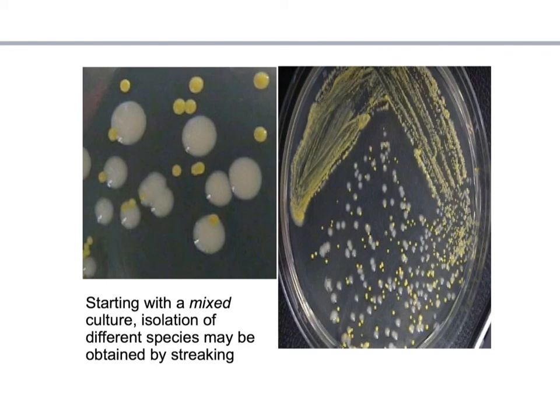The purpose of streaking a plate would be to take one of these bacteria that we're wanting to work with and transfer one of these colonies to a sterile agar plate so that we can grow one type of bacteria only.